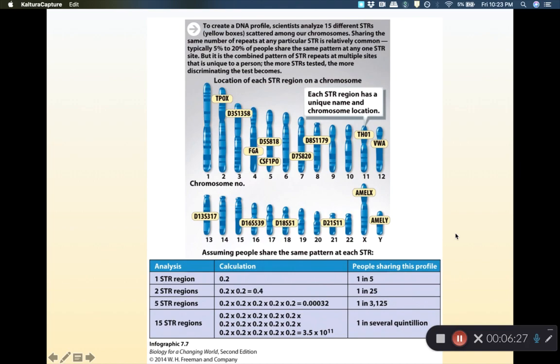So you might be wondering, okay, well, yes, we're using these short tandem repeat regions, but isn't it a possibility that multiple people will have similar short tandem repeats? What is the probability, and if we're not going to be sequencing the whole genome of every person, how can we be sure that the genetic profile, that unique banding pattern we're seeing, is in fact the actual individual with whom we're interested in? And again, the short answer sort of always boils down to math.